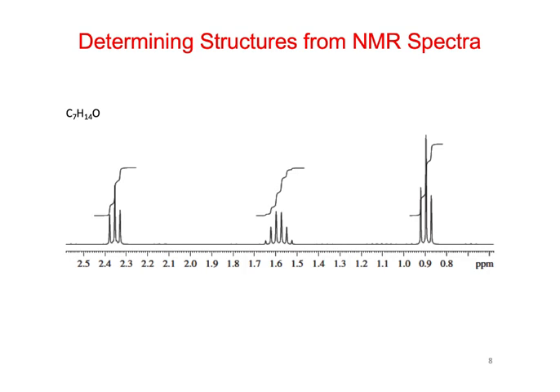So what do you see here, and what would you notice if you were doing this? Initially, I see 2 triplets and a sextet. Okay, so sextet. But there's a little bit of splitting in all of them.